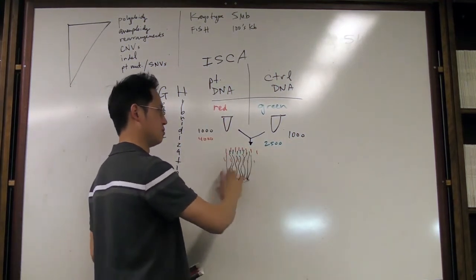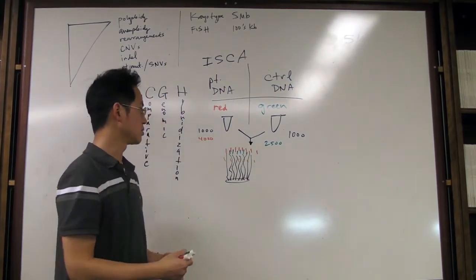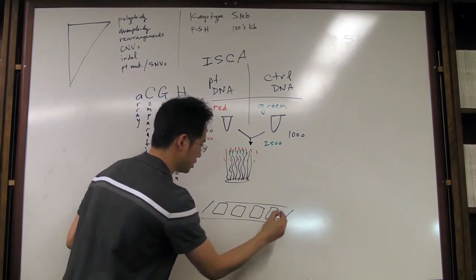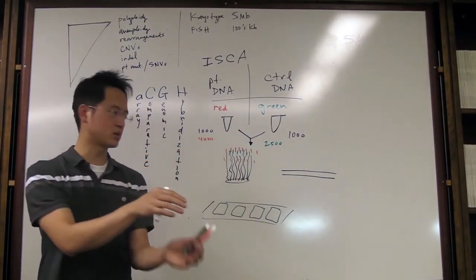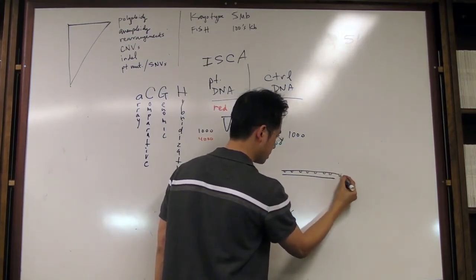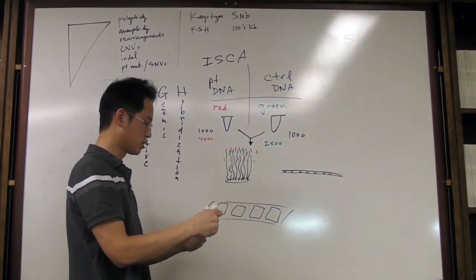So essentially you do this, allow to hybridize, we're doing now 48-hour hybridization at, I believe, 65 degrees is the temperature that we're doing. And during this process, what happens kind of technically is you have those 4 quadrants on the chip, and what you do is, this is the chip, you're going to put a cover slip or another slide on top to cover slip it, and this cover slip has sort of these gaskets, so it's the same rectangular shape here, 4 sets of them, and then when you press them together with this sort of contraption that essentially kind of squeezes the two together in sort of a pressure type situation.